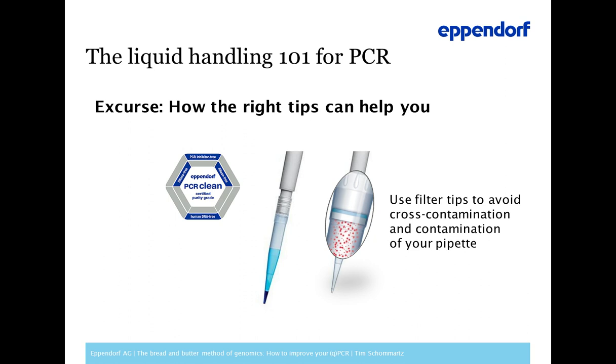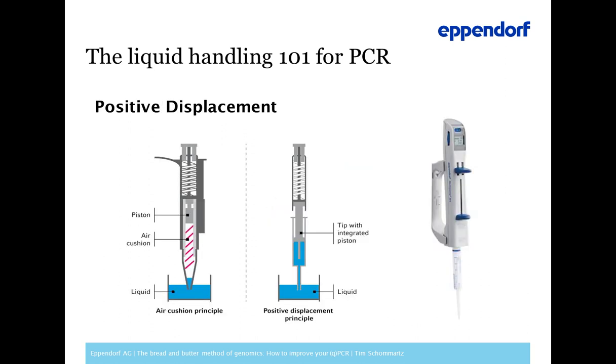I was working in a virology lab, and at some point, people from another department were coming over to our lab asking us if they can do their PCRs in our lab. The reason was that they were working with adenoviruses and they were not using filter tips, so all of the pipettes in their labs were contaminated with adenoviral DNA. So all of the experiments they were doing, all of their negative controls, they were positive at the end for adenoviral DNA. So then they cleaned up all of their pipettes. That's also a good measure from time to time. Disinfect and clean your pipettes, and then they changed to filter tips, and by that they became rid of this problem. So don't underestimate traces of DNA in your pipettes.